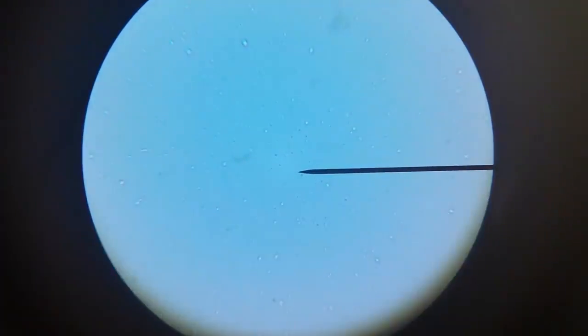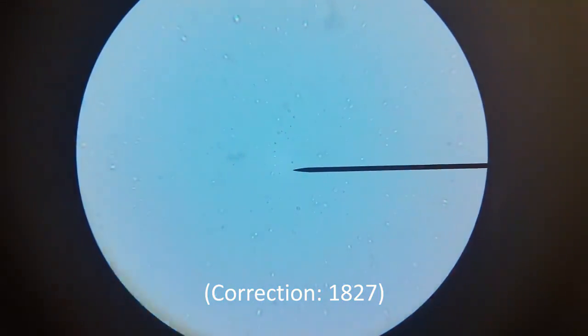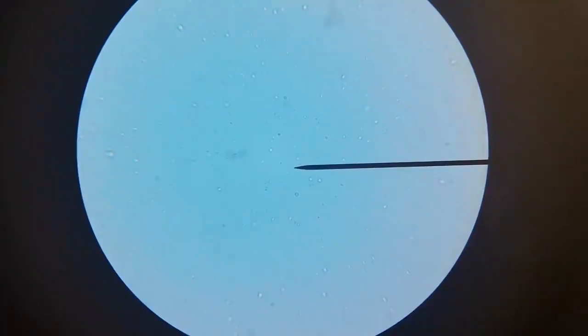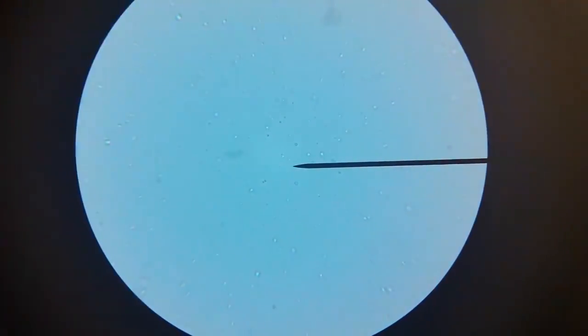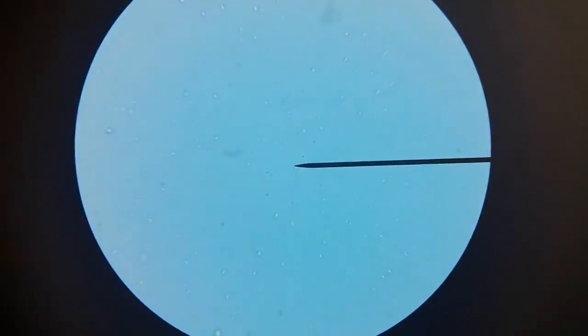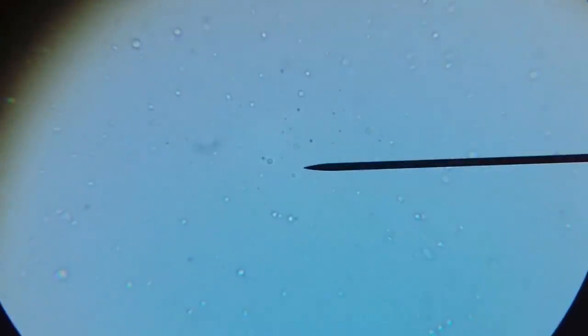This is what Robert Brown saw in 1829. You'll see the little droplets of milk fat are bouncing around. He wasn't sure exactly what this was, and although he was using pollen grain, he actually saw virtually the same thing.